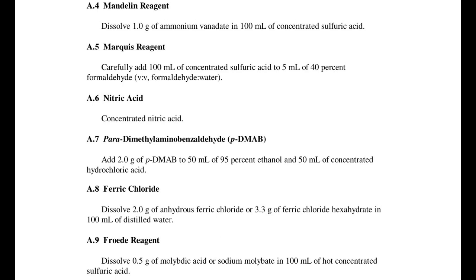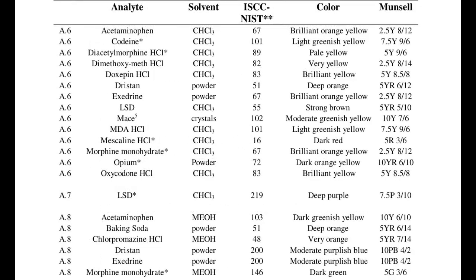And that brings us to the concentrated nitric acid. Again, nothing else, just concentrated nitric acid. Apparently, it can be pretty useful going by this results table. Who knew?